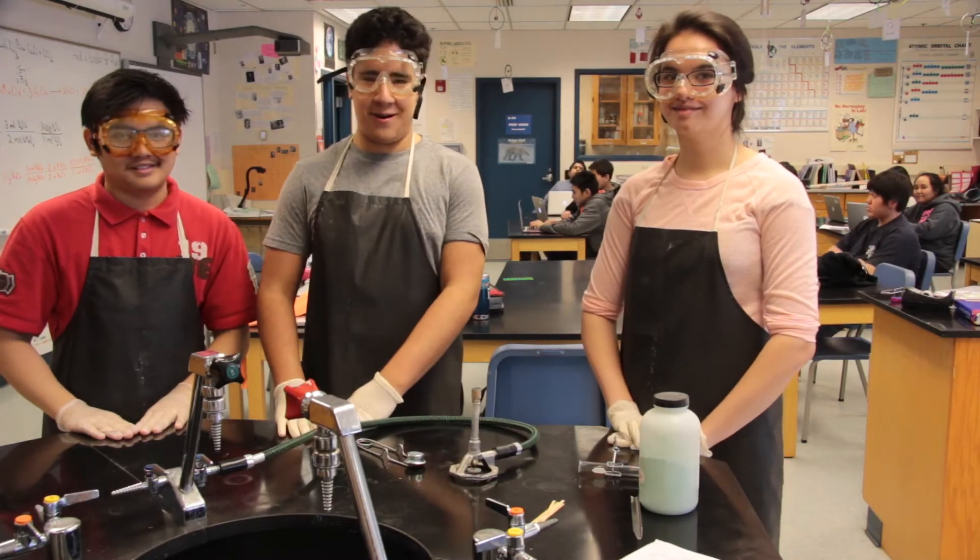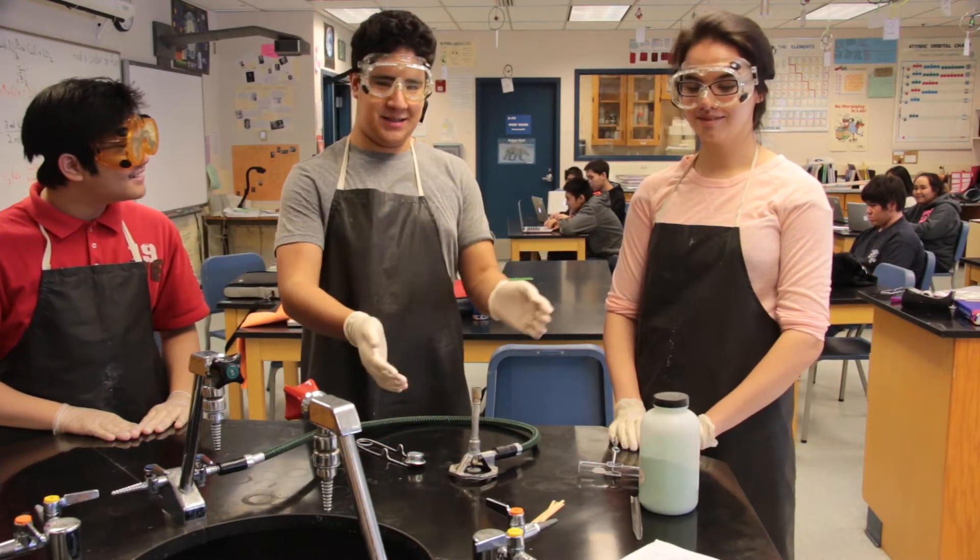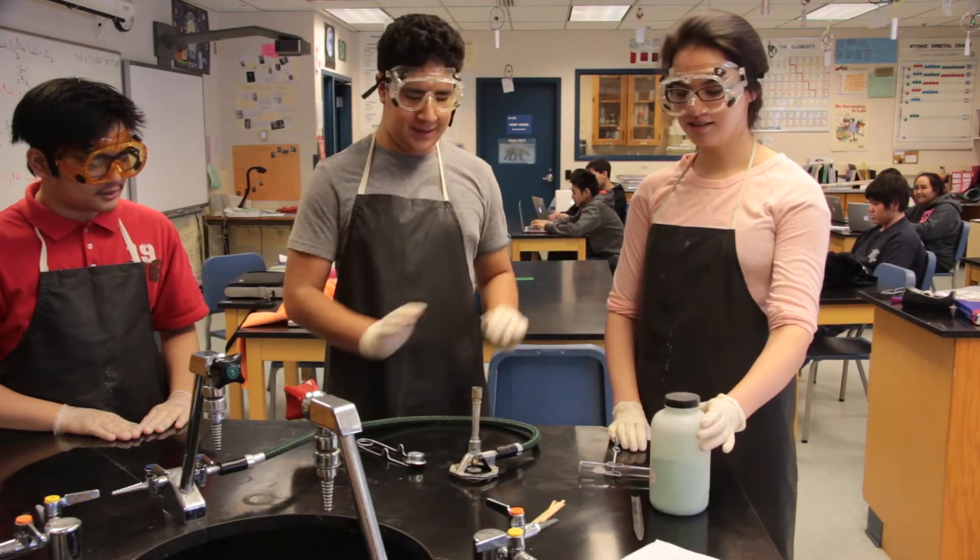Hi, I'm Ana. Hi, I'm Charles. I'm Miguel. And we're going to do a decomposition reaction with copper carbonate.